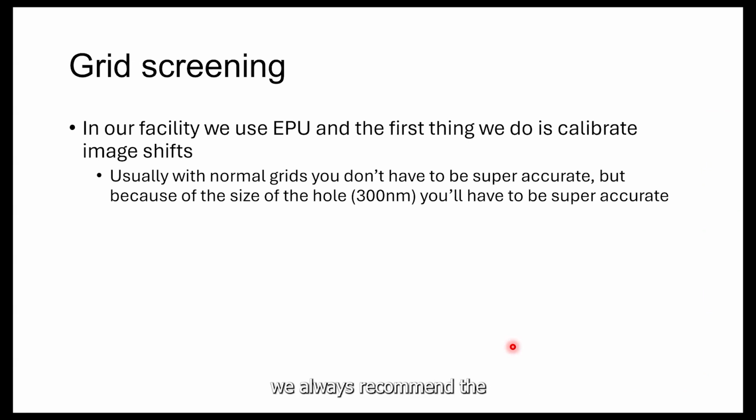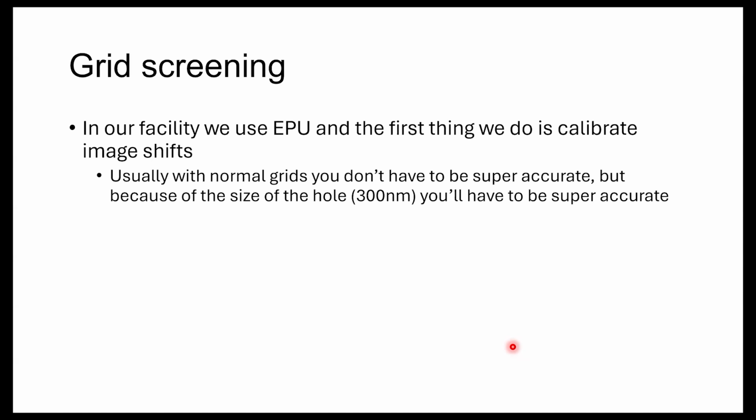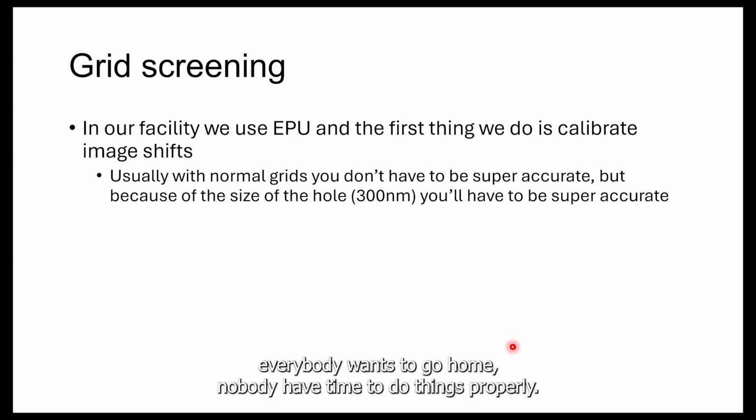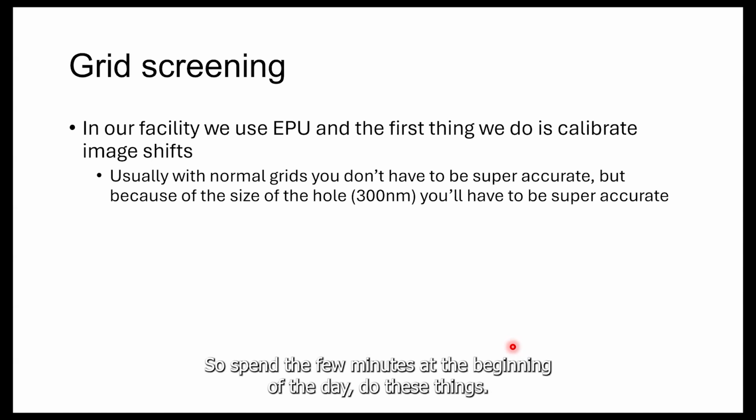In general, we always recommend students to treat the screening session as a data collection session. So if you make everything aligned and properly set up initially, you don't have to spend time at the end of the day to do it. Usually in the end of the day, everybody wants to go home, nobody has time to do things properly. So spend a few minutes at the beginning of the day, do these things.